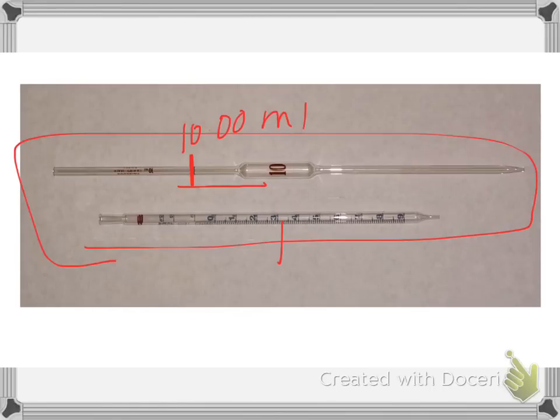And when I have one of these, I always have to look at what do I have down here because some of these have my 10. My 10 is going to be here, which means I stop when I get to that line. When I'm dispensing it into my container, I stop at that line.